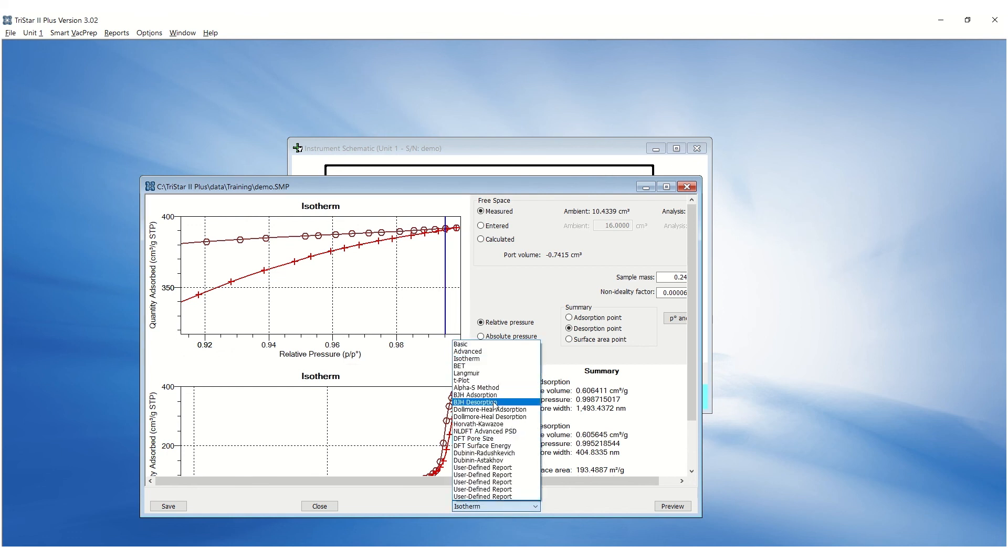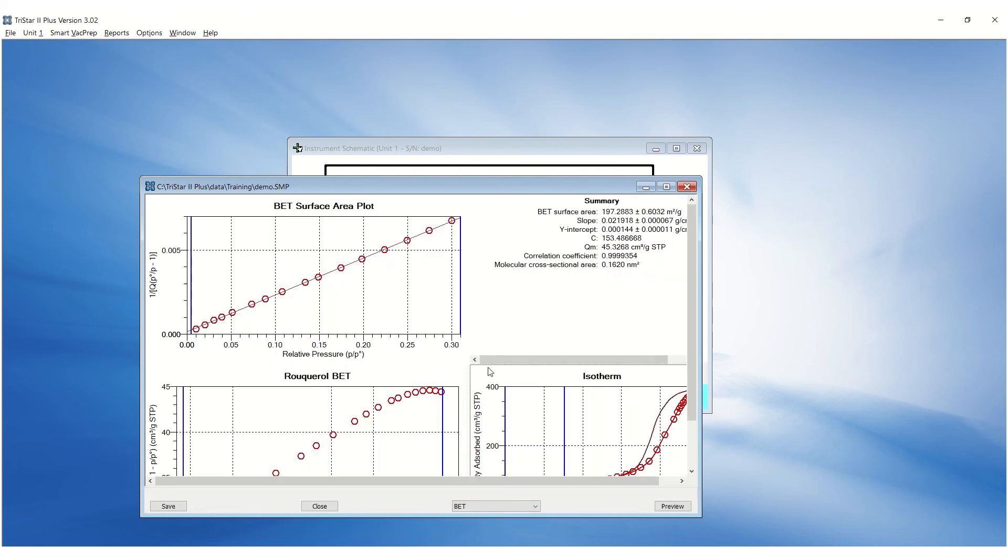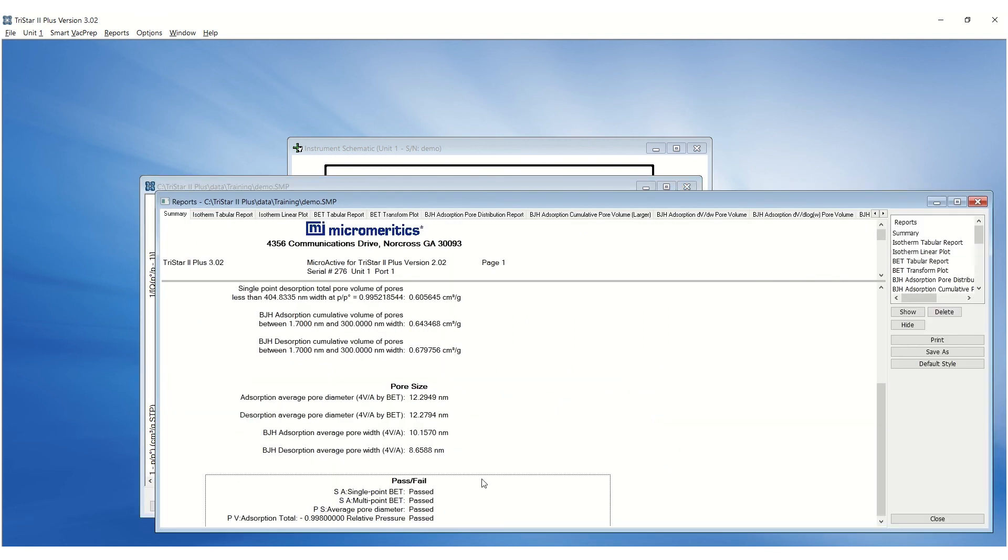Click on the drop-down menu below and select BET. Ensure the correct relative pressure range is selected to calculate BET surface area. Click Preview to view the result. The Summary page lists whether the results passed or failed the entered specifications.